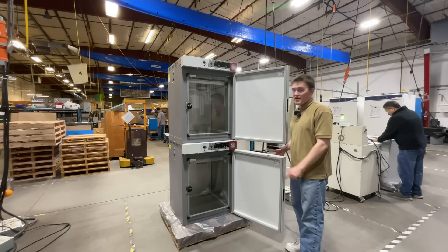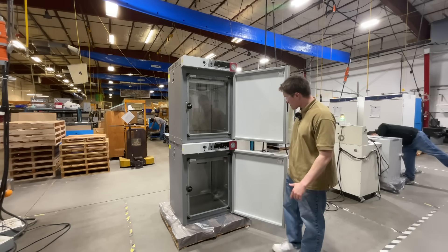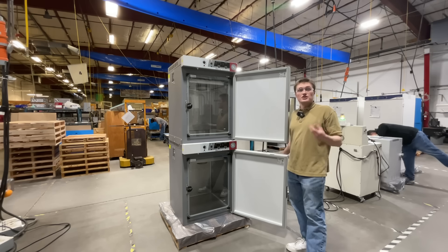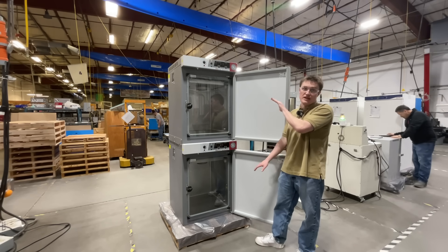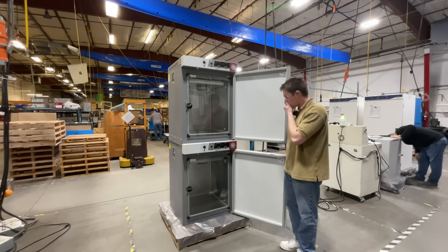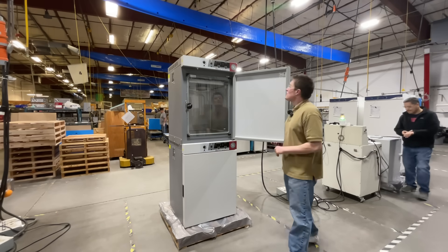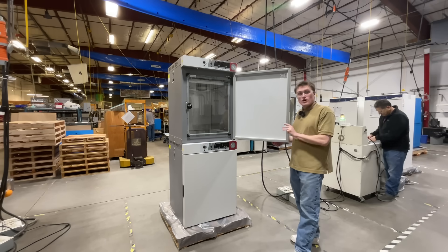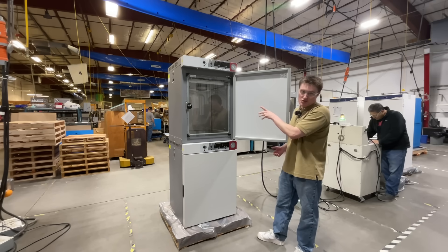Each SCO-10A features two independently controlled 5 cubic foot workspaces. These are great to increase throughput in your lab, especially if you want to have two different temperature ranges going at the same time. This unit features a double door, double gasket feature to provide stable, precise, and uniform temperature control.